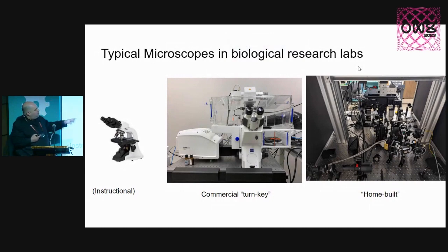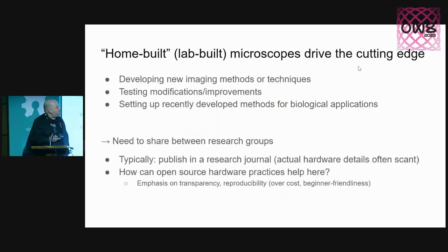And so you can see the complexity on the right, but that complexity really leads to function. And we want to share that design of all those parts with others, but just capturing what the model will make is not enough. It's expertise in how you build it and put it together. And so that's what this fellowship is about. And so we're really committed to building systems for innovation. Home-built microscopes are really what drives the field in cancer and Alzheimer's and Parkinson's. And these lead to open innovation, but also lead to companies. So a lot of these open hardware eventually become part of companies as well.